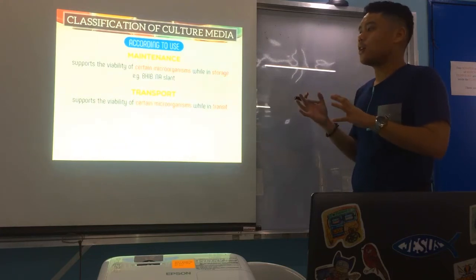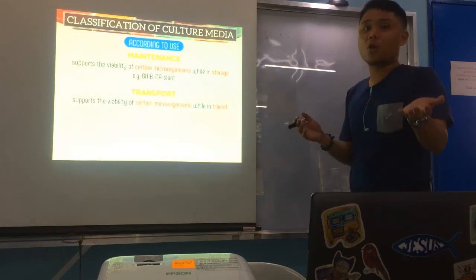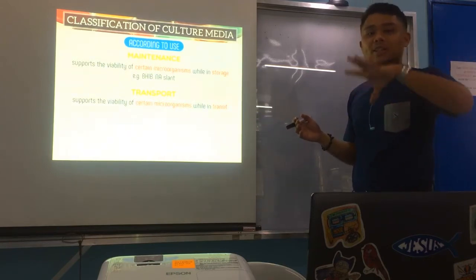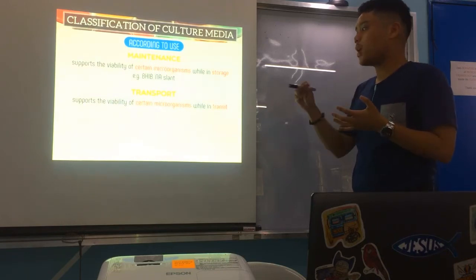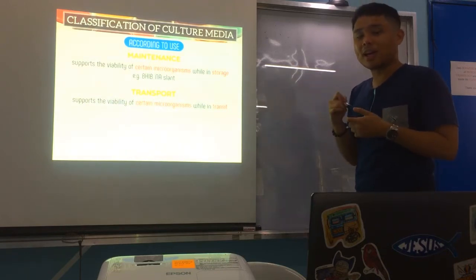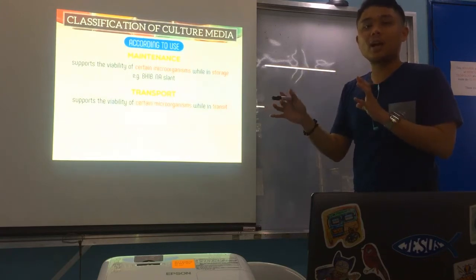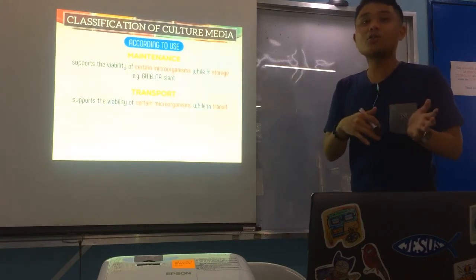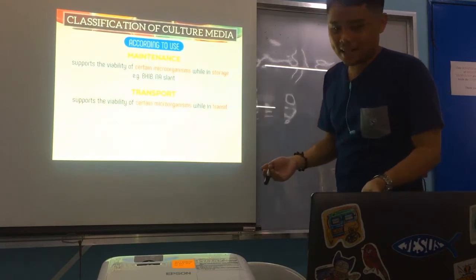And it's difficult if you do not put it in culture media while in transport. Example, for COVID-19 specimens that still have to be transferred, you need specimen transport because they can deteriorate or the organisms can die while in transport. So at least while in transport, they are in storage or in culture media so they can keep their growth and be supplied with nutrients.